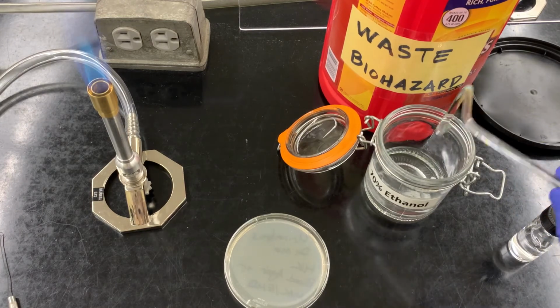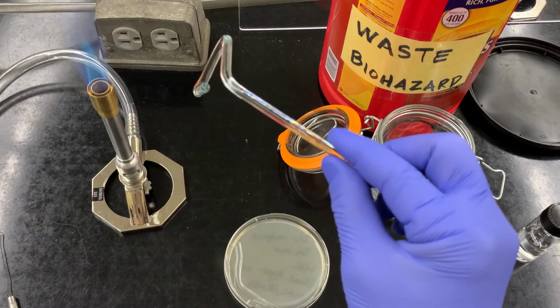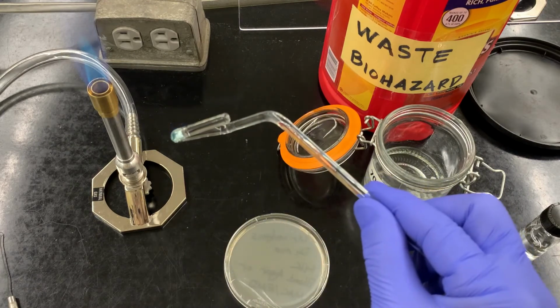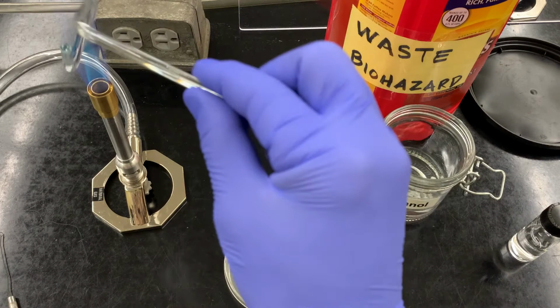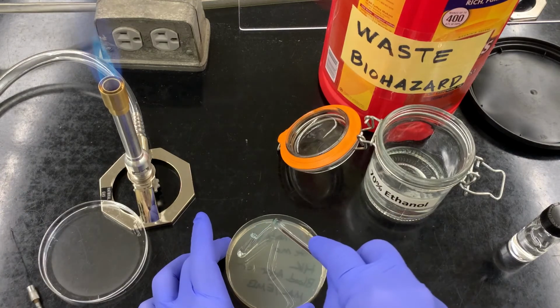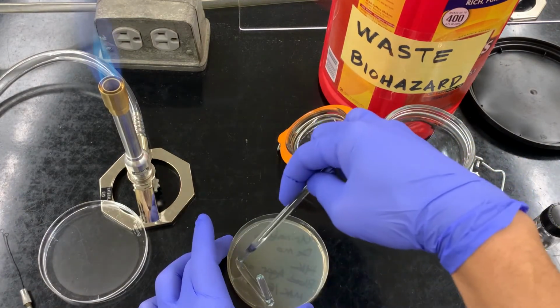Our spreader, remember our friend from the past, gentle, right? Not tap too hard. And then we're going to burn that ethanol off. And we're going to do it one more time. Nope, I still see a little flame, so I am going to do it a third time, making sure that there's no flame. Lid near our flame, and then I like to do this, touch, touch, touch, touch.